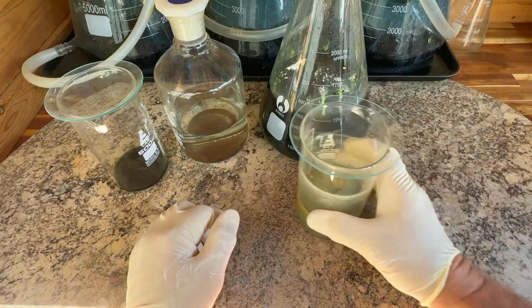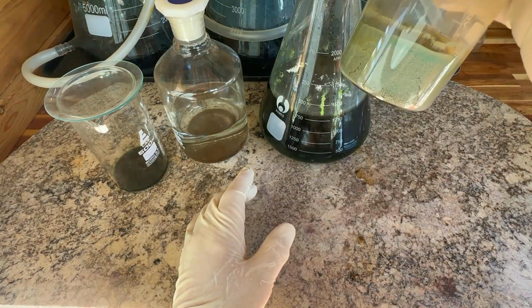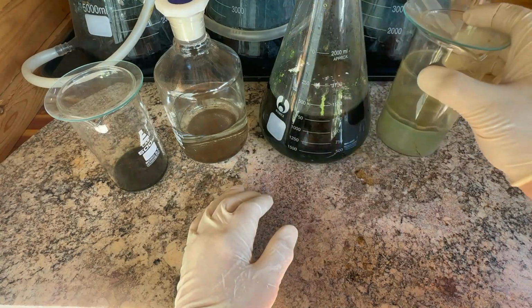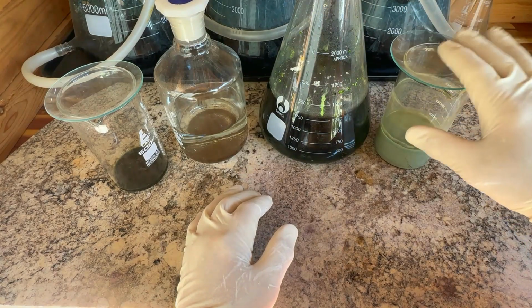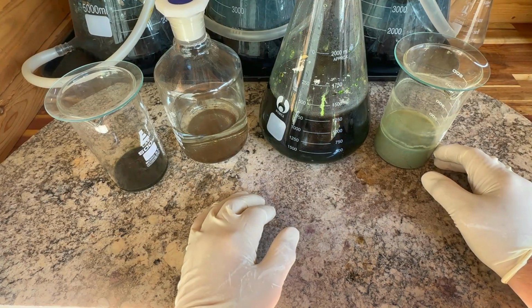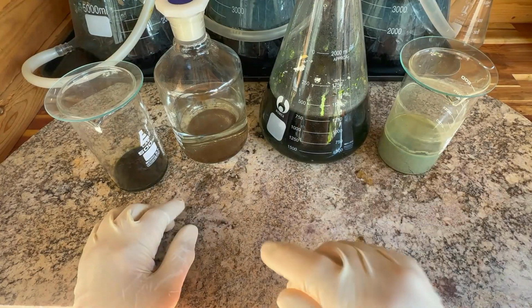And finally here, also for a separate video, we have some cement and silver. This has been accumulated over several gold-filled refines. There's not a ton there. You can see it's pretty contaminated with copper. So we'll be going the sugar lye method, and we'll be doing a video on that here in the near future. All right, so let's get ready and get refining.